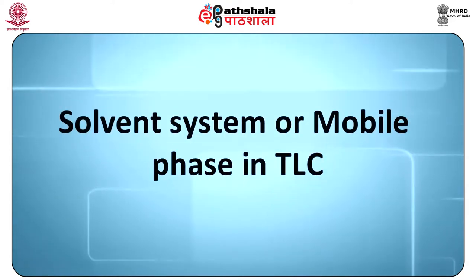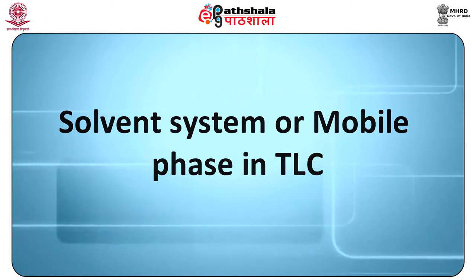Solvent system or mobile phase in TLC. Mobile phase is liquid in thin layer chromatography. The mobile phase is usually a combination of 2 to 5 different solvents, selected empirically using a trial and error method, guided by prior personal experience and literature reports of similar separations.